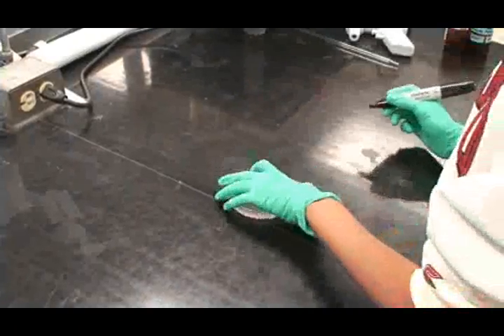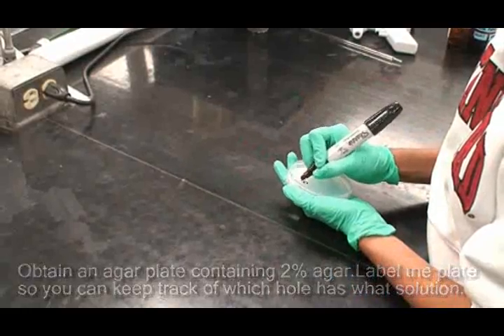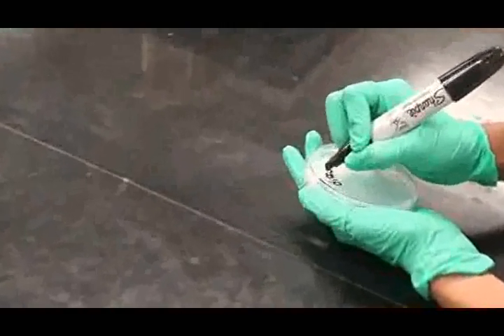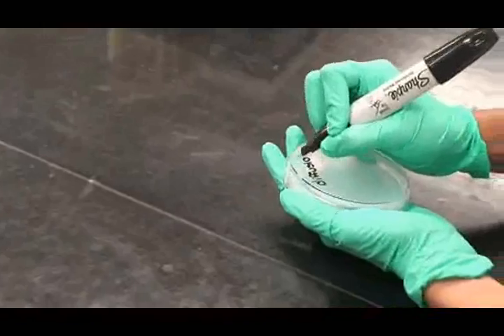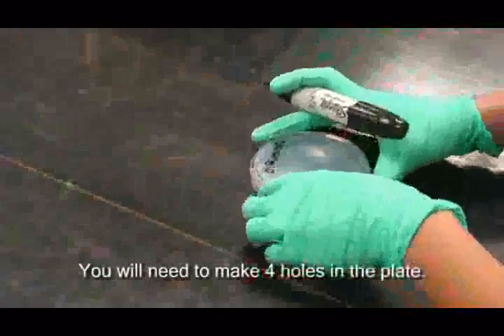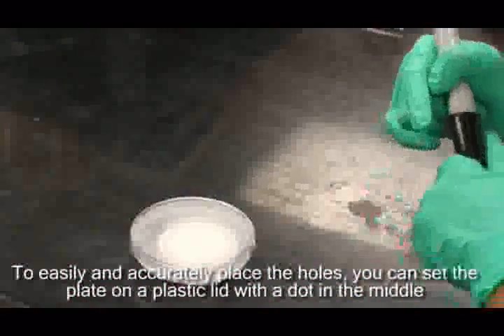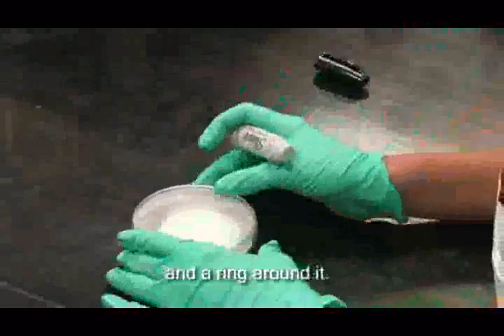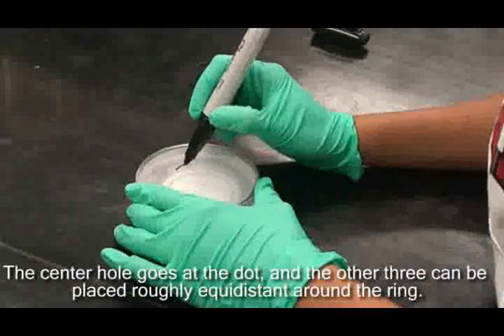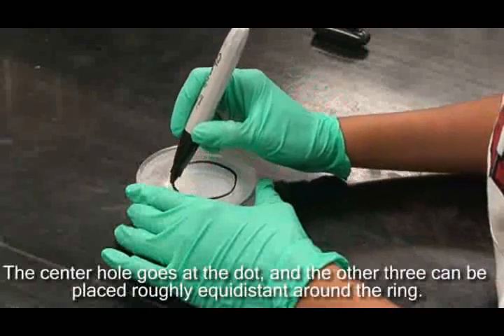To start this experiment, obtain an agar plate containing 2% agar. Label the plate so you will be able to keep track of which hole has what solution. You will need to make 4 holes in the plate. To easily and accurately place the holes, you can set the plate on a plastic lid with a dot in the middle and a ring around it. The center hole goes at the dot, and the other 3 can be placed roughly equidistant around the ring.